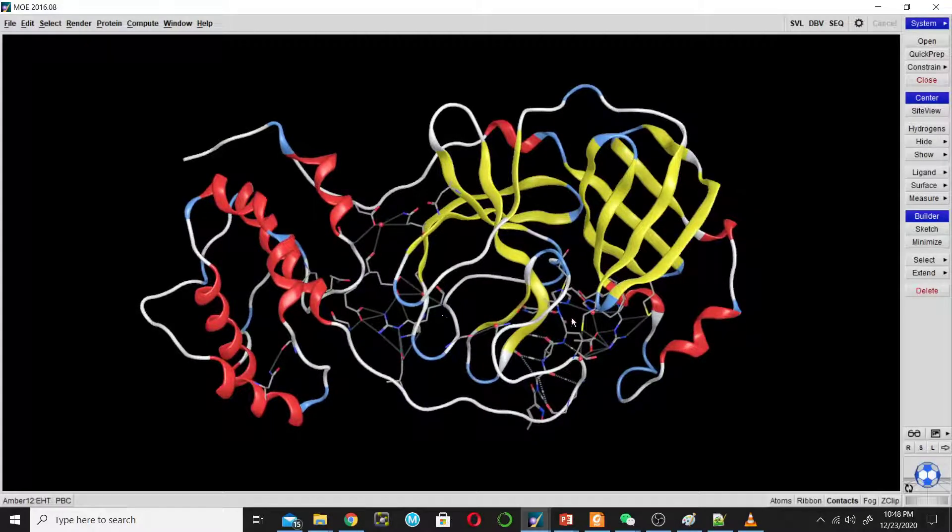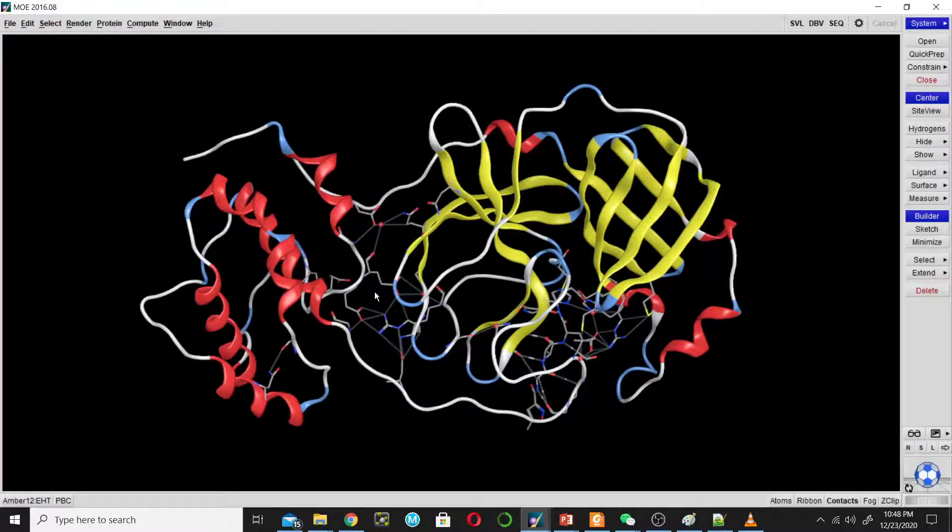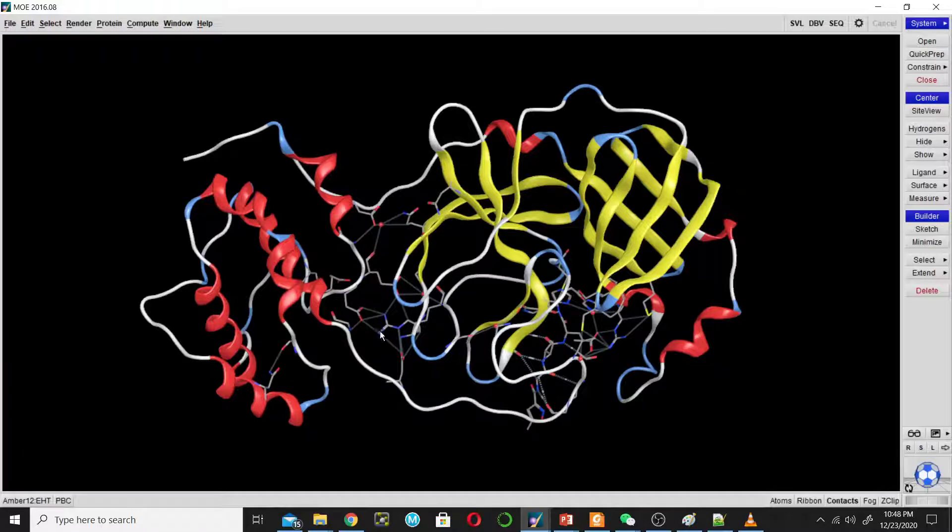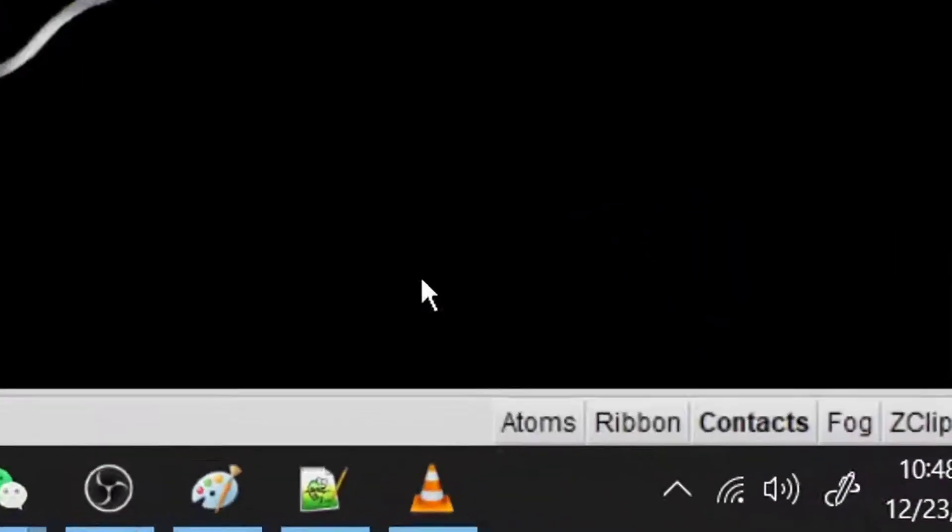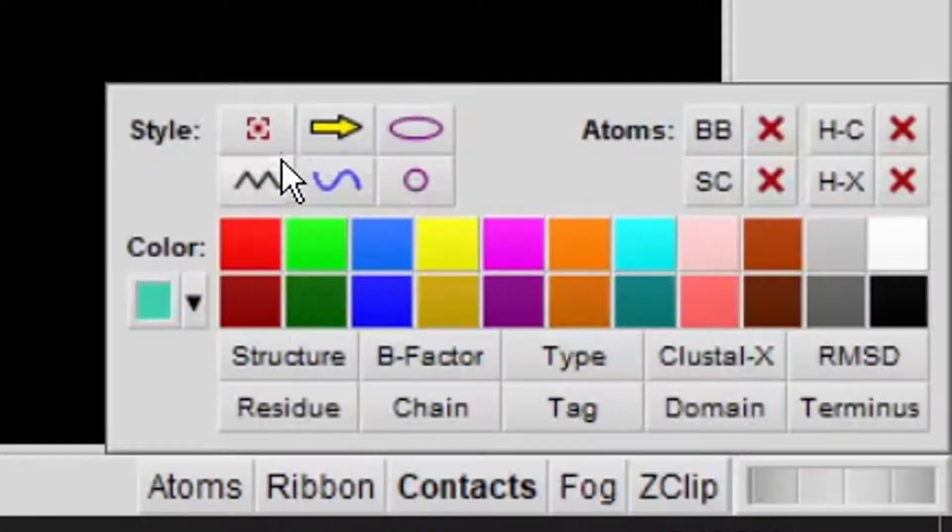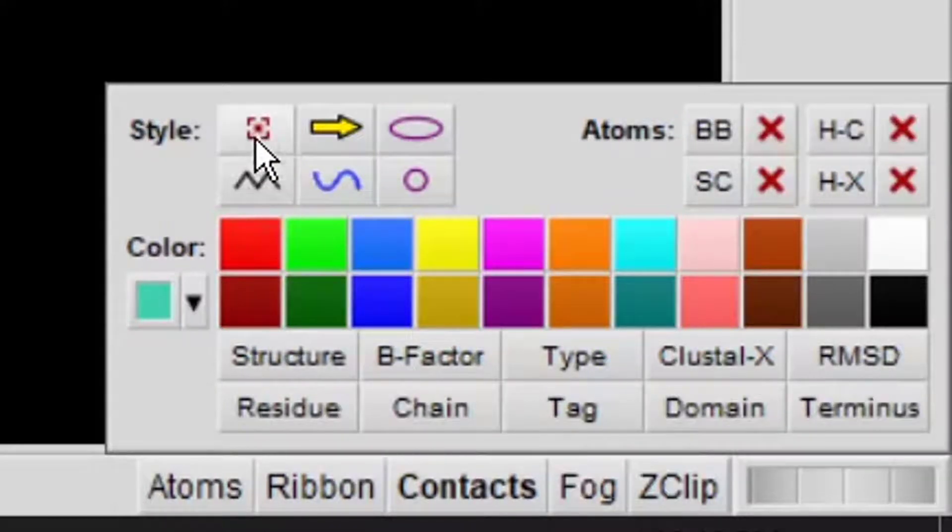One is the cartoon representation and the other is the sticks representation. I will hide the stick representation to make it more clear. So go to ribbon. Here are different options available for the ribbon representation.